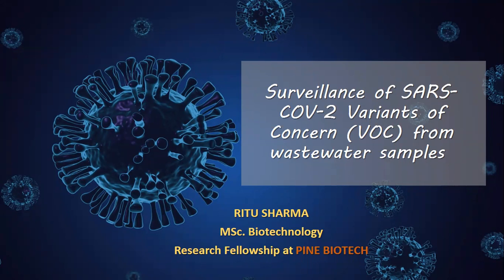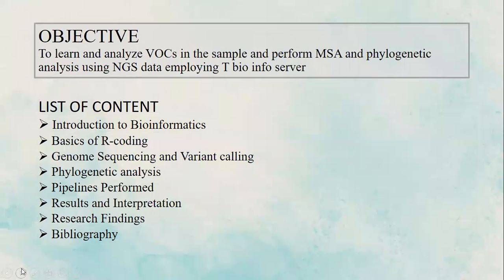Today's presentation is based on my project, which is on the topic surveillance of SARS-CoV2 variants of concern from wastewater samples. The objective of my project is to learn and analyze variants of concern in sample and perform MSA and phylogenetic analysis using NGS data employing T-Bioinfo server.